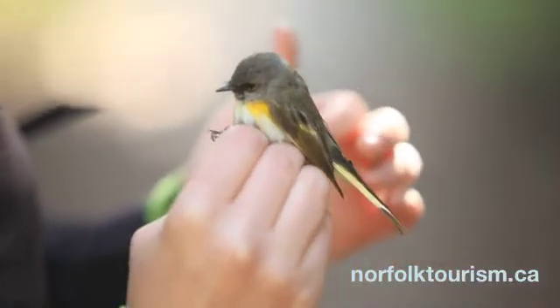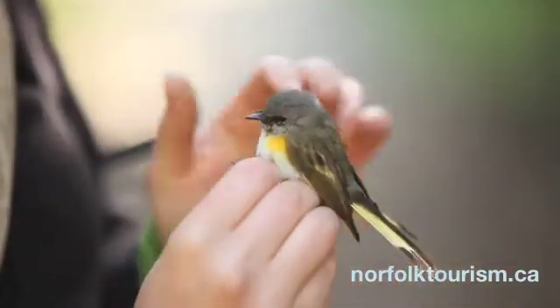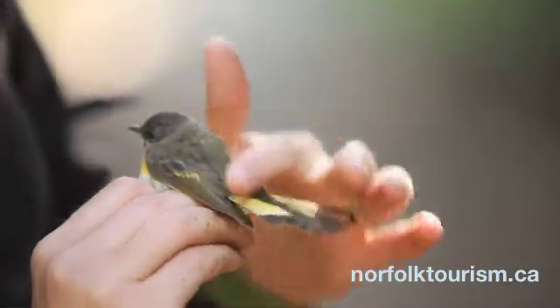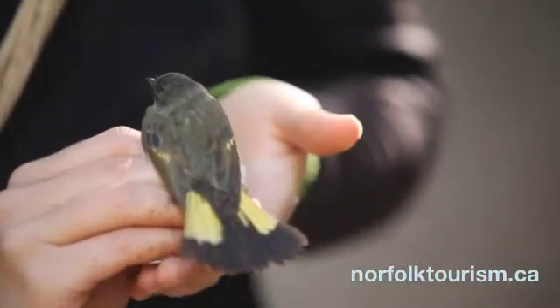We just extracted an American Redstart from our mist net 13. This is actually a young male — we can tell by some of the black mottling that's coming through on the face. They're a really pretty bird because when they fly away, they always fan their tail and you get to see a flash of color.